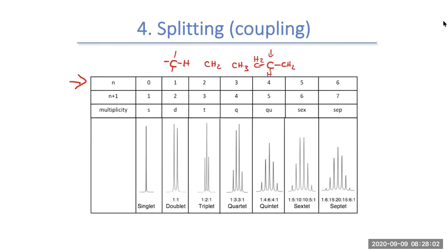One important thing when we're talking about neighbors is our atoms are usually 3 bonds apart. What that means is if we're looking at this hydrogen, then it'd be 1, 2, 3 bonds to the next hydrogen. If, let's say, we have another carbon here and then another hydrogen, that would be 4 bonds. 4 bonds do not show peaks typically. It's typically 3 bonds apart.